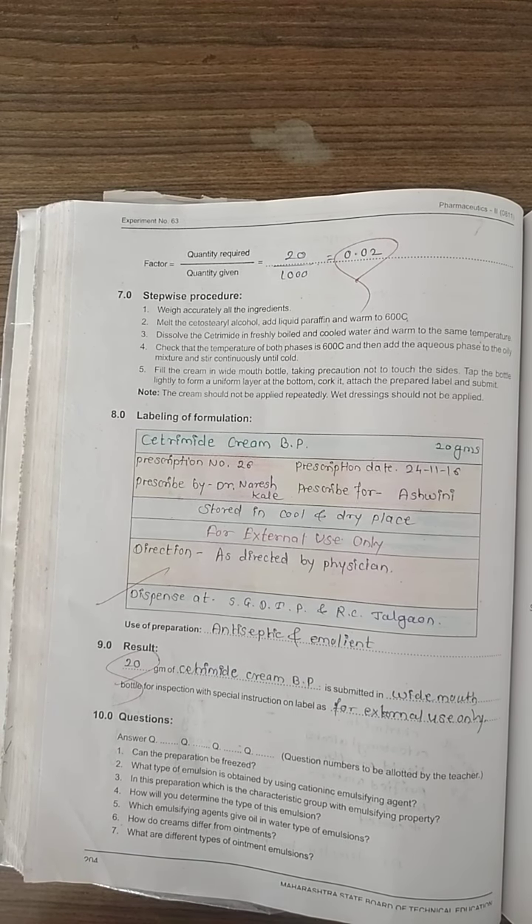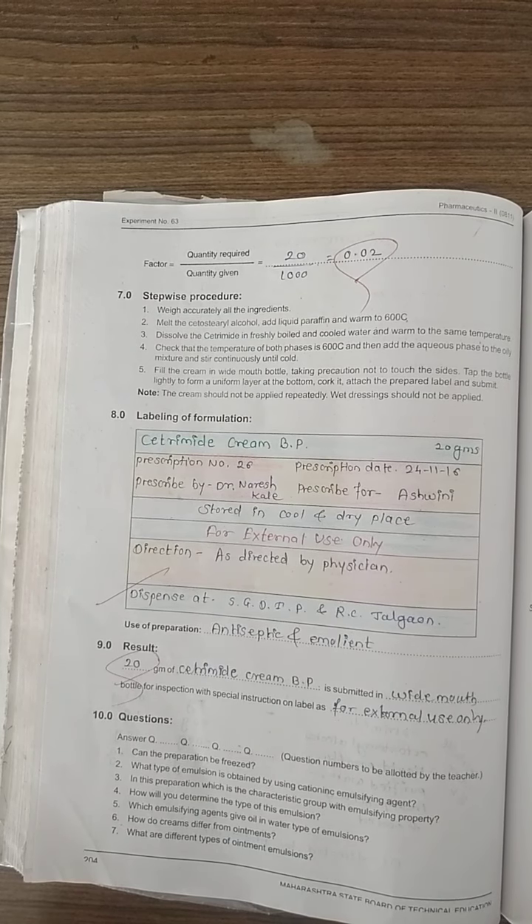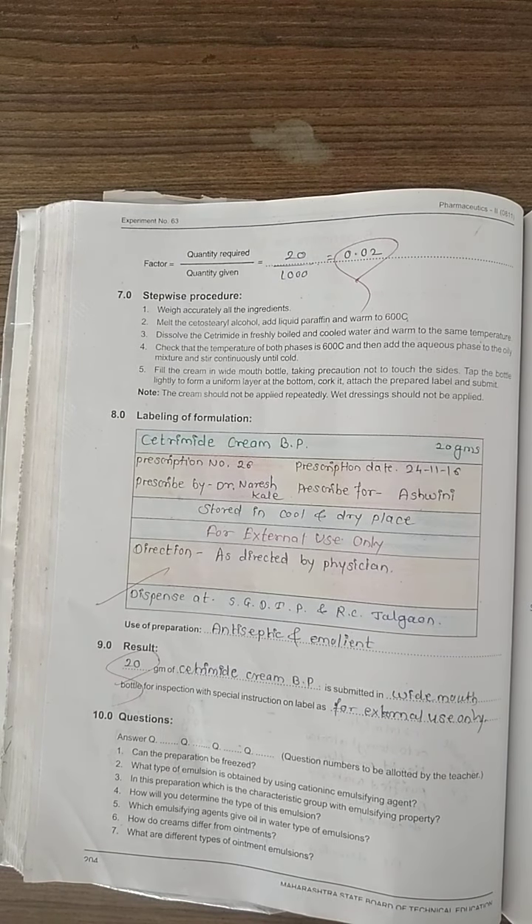We have made cetrimide cream as per British Pharmacopoeia. We use it as an antiseptic or as an emollient — specifically as an anti-infective for minor burns to heal and treat them. Result: 20 grams of cetrimide cream is submitted in a wide-mouthed bottle for inspection with special instruction on label for external use only. Experiment number 63 ends here.